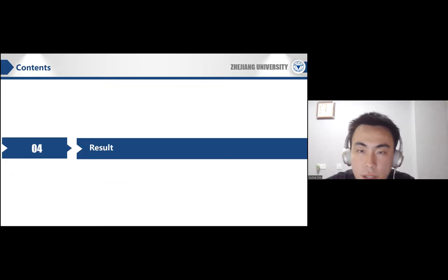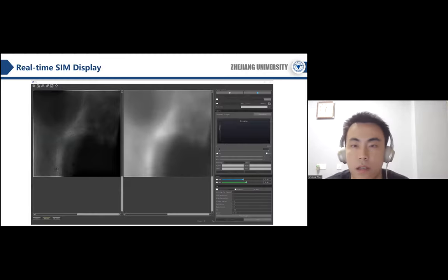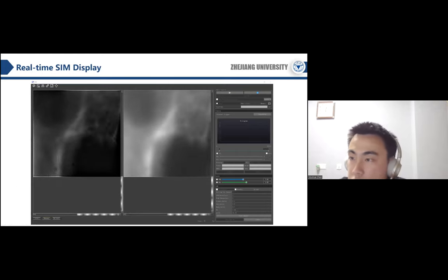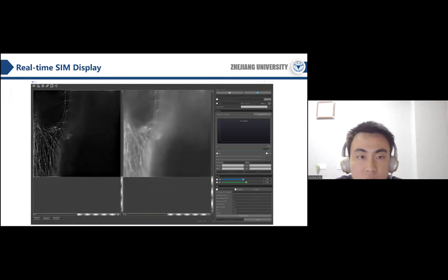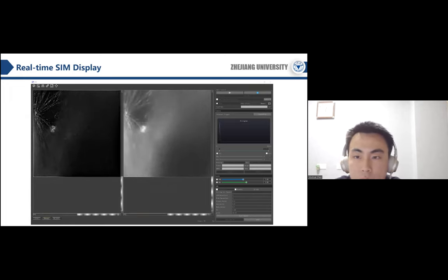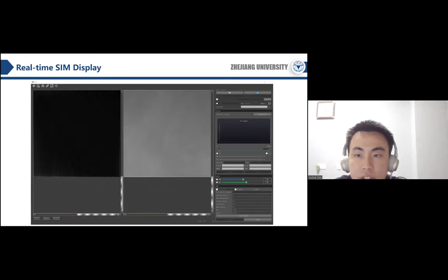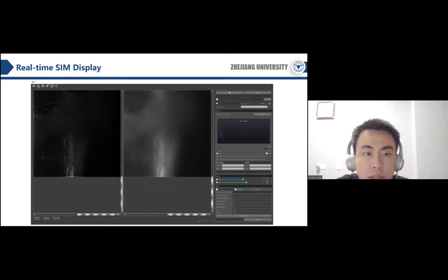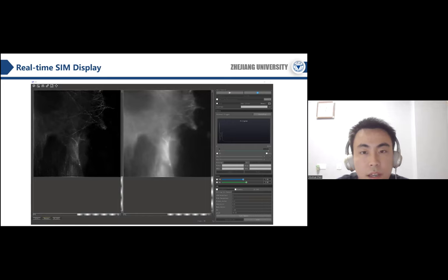We proved the system's capability of real-time SIM imaging in 2D-SIM, TIRF-SIM, and 3D-SIM modes. This video shows the progress in real-time 2D-SIM reconstruction mode. The imaging speed is 10 FPS, the exposure time is set to 30 milliseconds, and the original image size is 512 by 512 pixels. We can see the speed is fast.